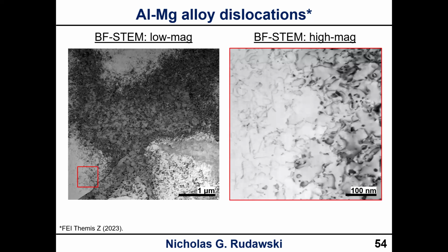Over on the right, I'm closer to an area that is near the Bragg condition, so my dislocations do not look as sharp in terms of contrast, because I'm getting more of a contribution from the non-dislocated background. But as I transition to the left, my dislocations become sharper and well-defined, because I'm deviating more from the Bragg condition.